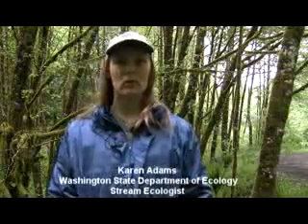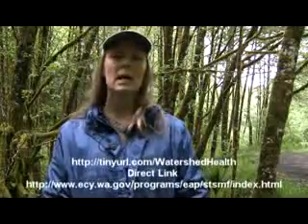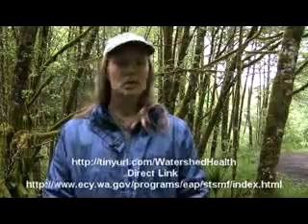Hi, I'm here to tell you about the process we use to collect macroinvertebrate or bug samples from wadeable streams in Washington State. If you want more information on this process, you can go to our website at tinyurl.com/watershedhealth. So the procedures we're going to talk about today are used by the Status and Trends Monitoring for Watershed Health program and also by the Freshwater Ambient Biological Monitoring program.